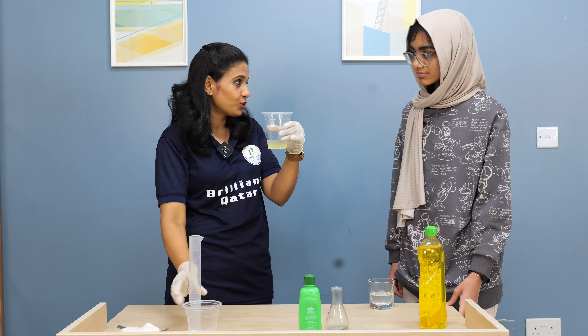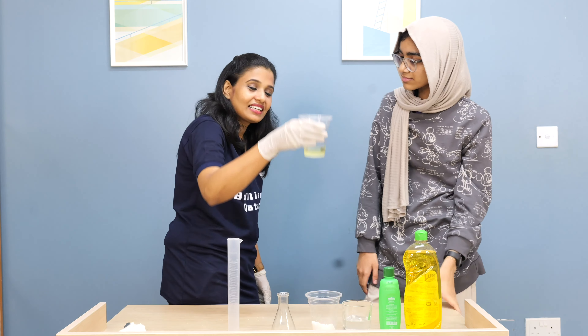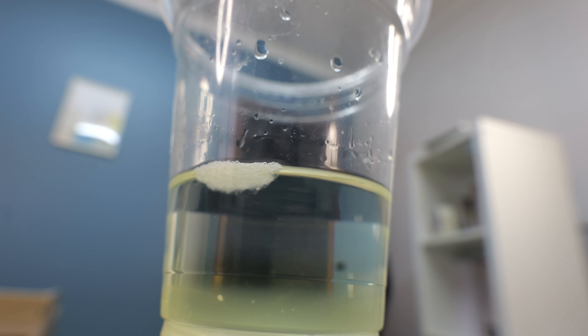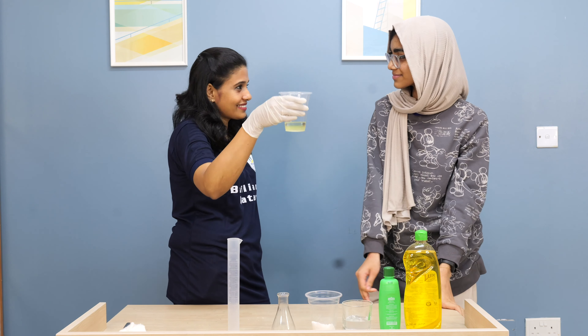Then wait for two, three minutes. Let's see. Can you see it? Yeah, I can see it. It's like small strands. Yeah, so we extracted the DNA.